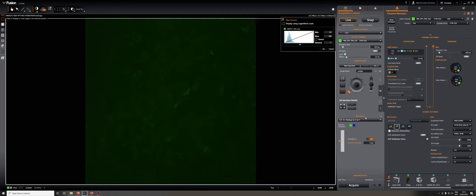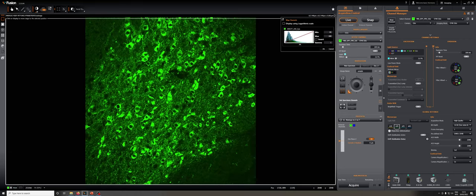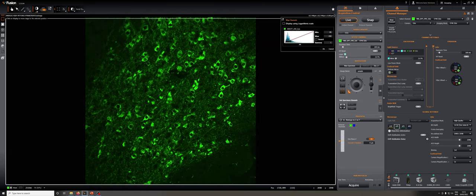You can see that this is not perfectly parfocal, so I'm going to adjust the focus, and there I am in an area with a 20x objective with clearly labeled cells.